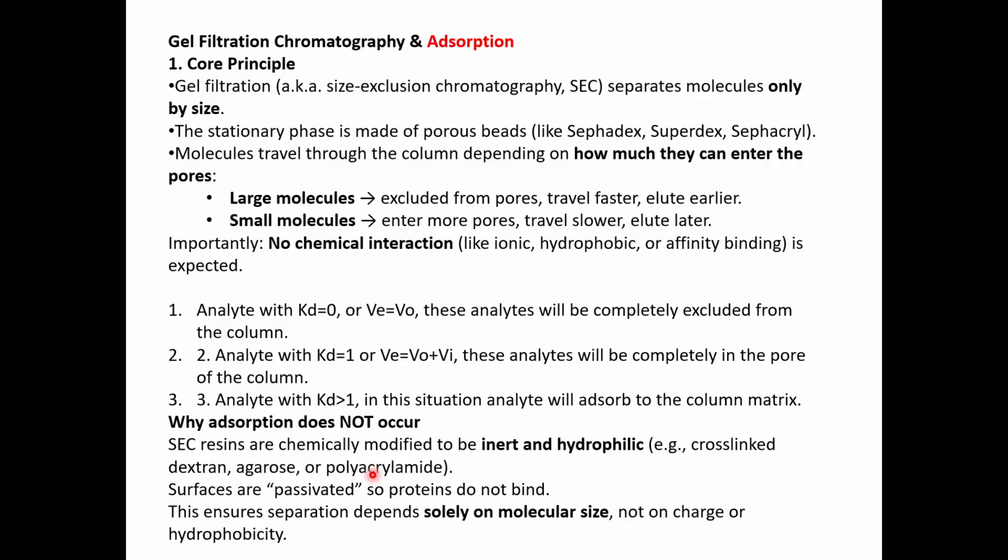So it should not have any kind of adsorption. The surfaces are basically passivated. That means they do not have any active reactions with the sample. So they are passive and do not bind to the protein. This ensures that the separation depends solely on the molecular size, not on the charge or hydrophobicity.